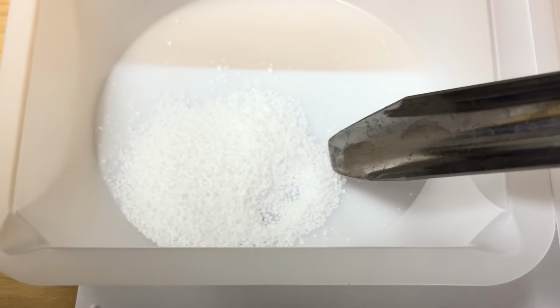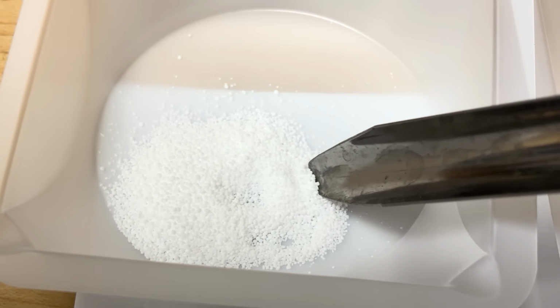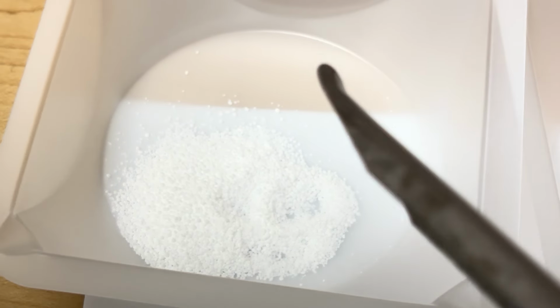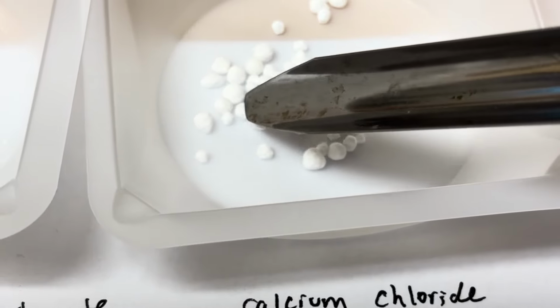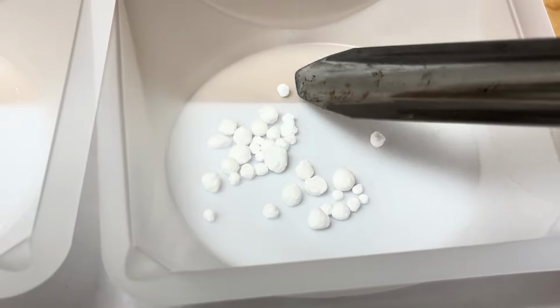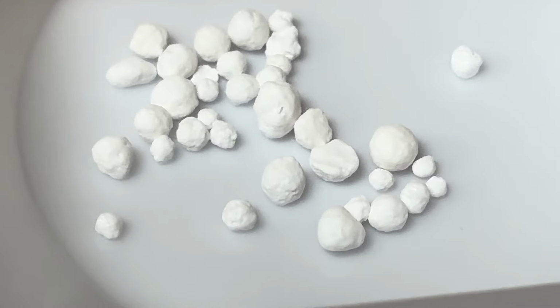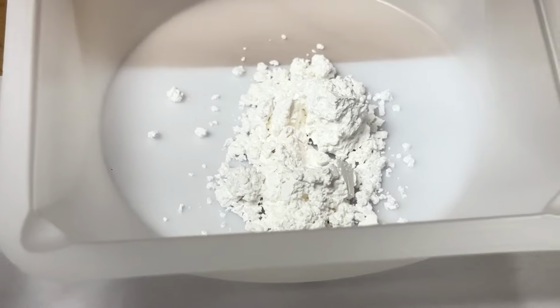The potassium carbonate looks like, I don't know, really small white spheres, maybe. We can see individual grains of this salt really easily. The calcium chloride is made of larger chunks, and if we look really closely, they look a little bit chalky, maybe? I don't know. And then the calcium carbonate is a different texture from the potassium carbonate.